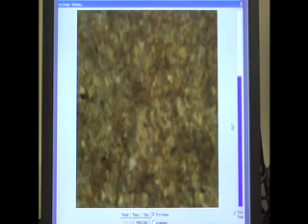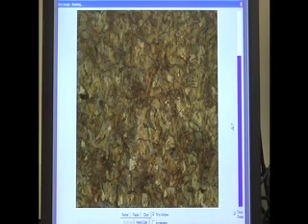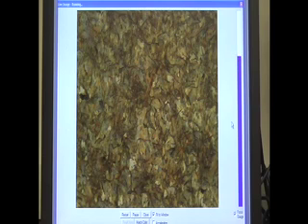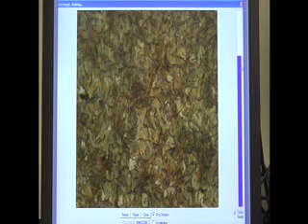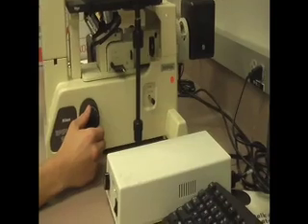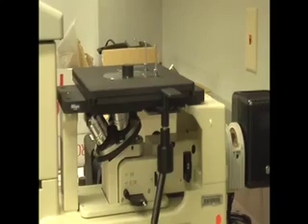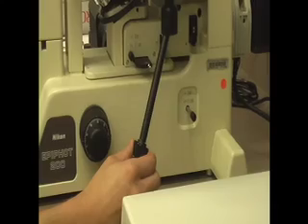The focus gauge on the right side allows you to obtain maximum clarity. When the gauge reaches its highest point, it is in focus. Use the stage controls to move the stage forwards, backwards, left, and right. This allows you to view different parts of your sample.